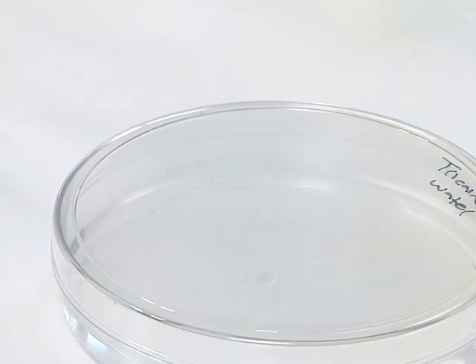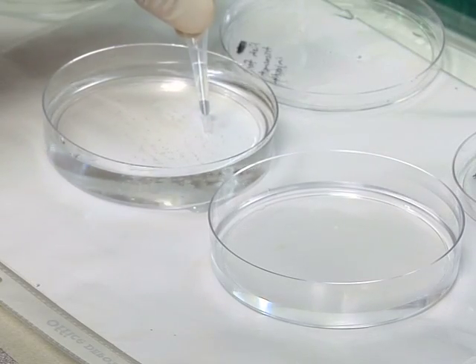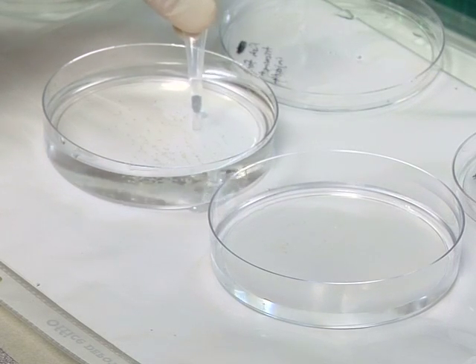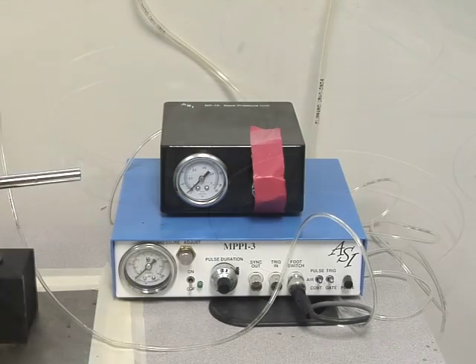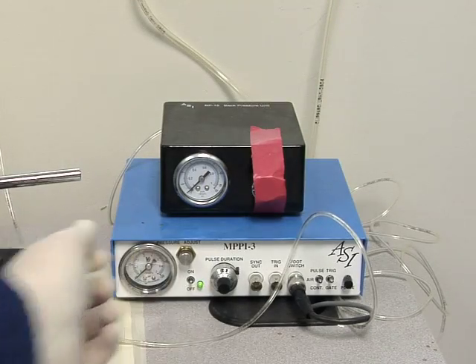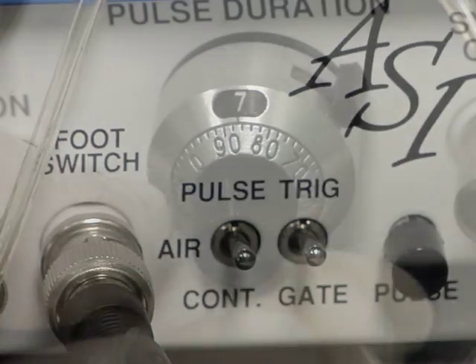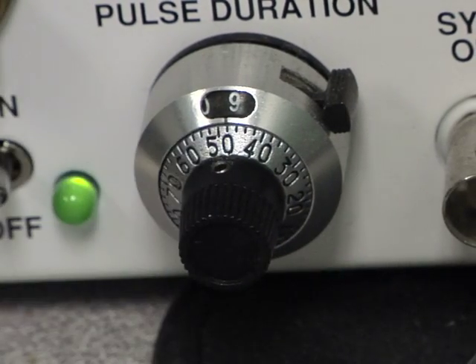Prepare a 200 mcg per milliliter solution of tricaine methane sulfonate to anesthetize the fish. Using a transfer pipette, collect 20 to 50 embryos and place them in the anesthetic solution for 1 to 2 minutes or until they stop moving. In the meantime, turn on the injection unit, making sure the pressure switch is on pulse and the pulse duration is set to 9 with 3 psi for the back pressure unit.